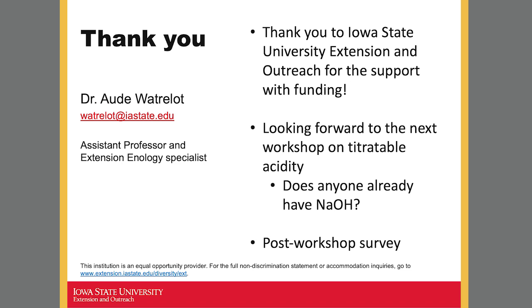So looking forward to the next workshop, we're going to be looking at titratable acidity. So a different way of measuring acidity in your products. It measures something slightly different than pH. So it is very important to think about both of them. Some might already have a setup for measuring titratable acidity with a burette and their sodium hydroxide. If you don't, make sure to get some of that 0.1 normal sodium hydroxide, restock or see where you can get that. Email us if you have questions about sourcing that, but hopefully if you've got an operation established, you kind of know where to get those things, but if not, please feel free to reach out to us.